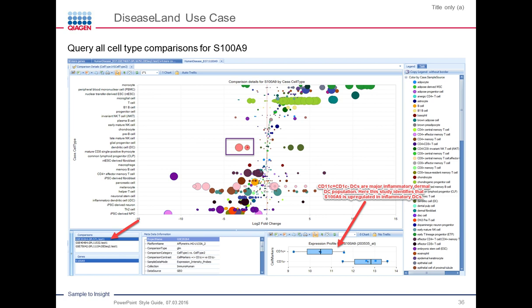Okay, and then so basically what I've shown now is how we interact with the software, and we would be taking a full gene list. But also sometimes we might have identified a particular regulator within a pathway, a particular gene basically, that we really wanted to extensively credential. And so what we could do is specifically query the database for that particular gene.